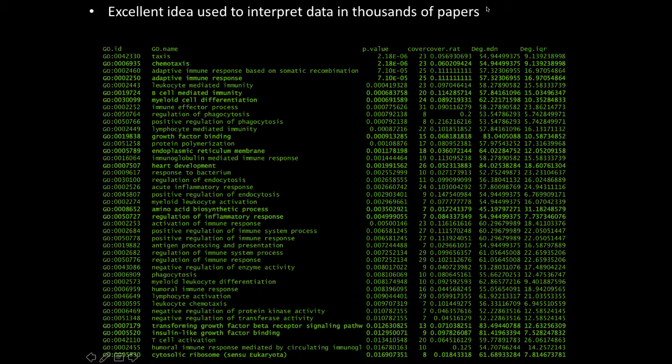Pathway enrichment analysis is very useful. Tens of thousands of papers have used it, but the way almost everybody views the results as a table is not the nicest way of seeing them, because pathway names that are related to each other are spread out all over the list. If you want to see the general themes, there's redundancy.